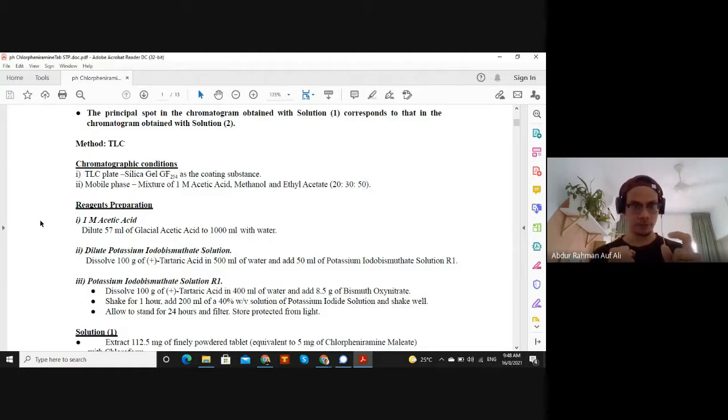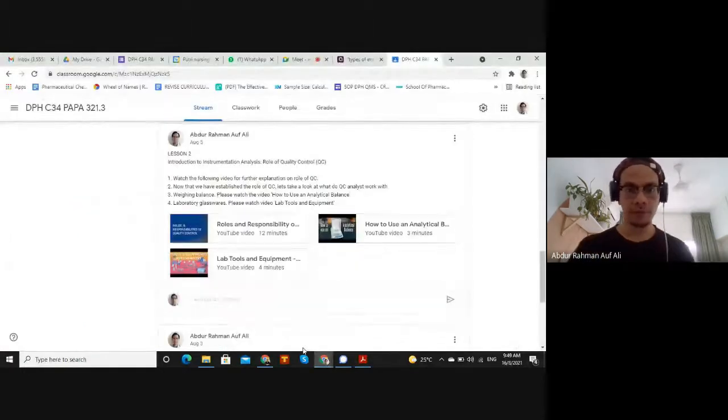important in a tablet. So untuk bandingkan, untuk perform a test, untuk check whether dia mengandungi kandungan API yang betul ataupun tidak, kita perlu gunakan sesuatu bahan yang mempunyai kandungan API yang tinggi. So we should use a substance yang mana ketulinannya tinggi. Okay, so I'll show you a picture of a reference standard.